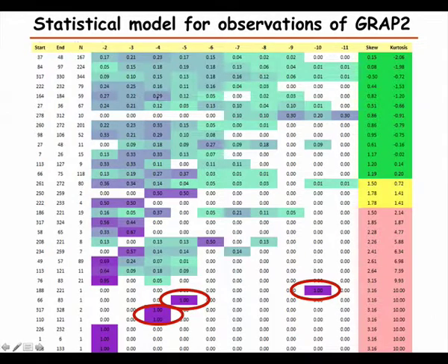Then we have another case where we have a group of very good peptides, some borderline, and then some bad ones. Even though we have several observations, by looking at the skewness and kurtosis here, we can say that even if we have many observations, it's not very likely that these are real.